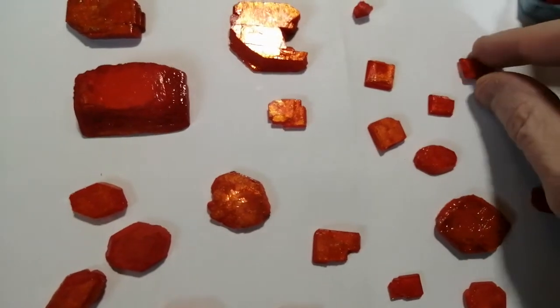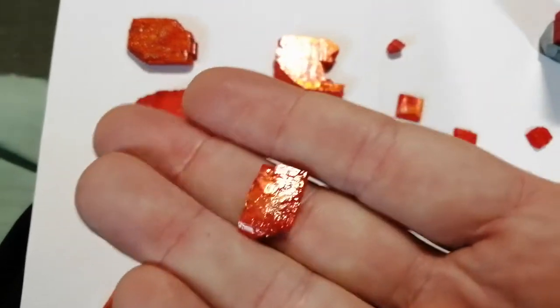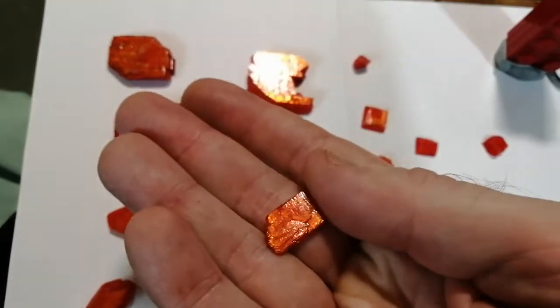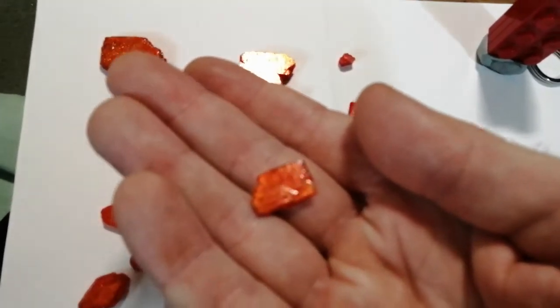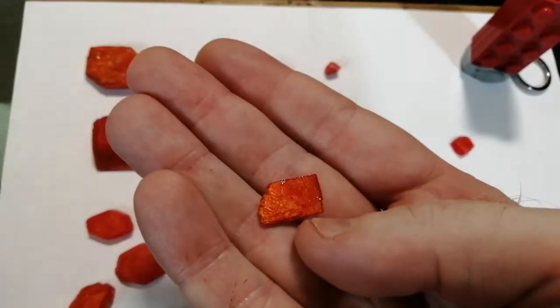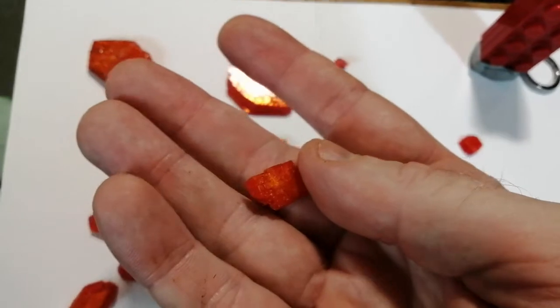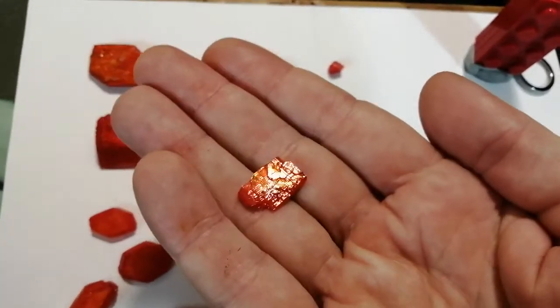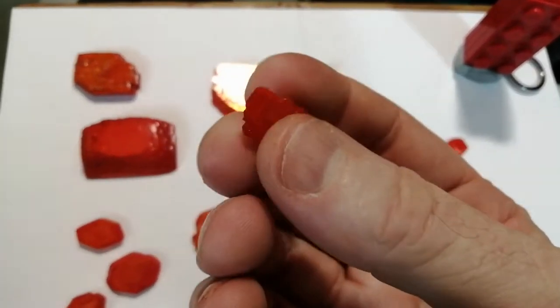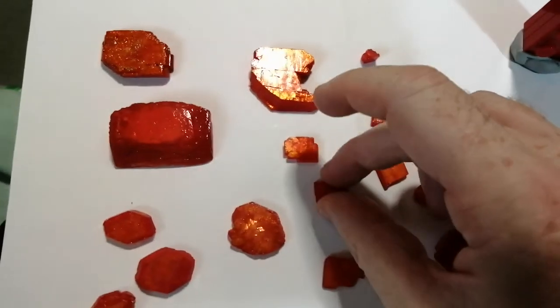These are thickly varnished just like the other crystals I showed in the last video. In fact, all the crystals that I've grown over the years have been thickly varnished to protect them from dissolving in the house atmosphere, humidity, etc. And in the case of the more toxic chemicals, to protect me. But I'm not so afraid of this chemical as I am of, say, the potassium ferric cyanide.